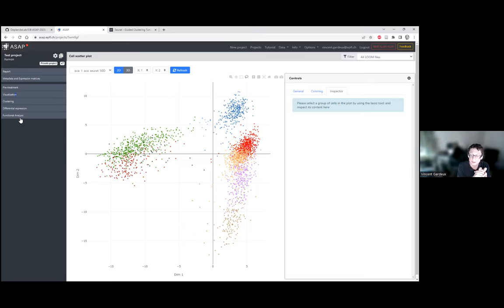So for now we have a pipeline, we have a tool for automatic annotation. We actually use ontology for training a classifier system. So we really use the hierarchical tree of ontology to help the classifier to classify the cells. It's not yet in production. So we are still working on it. But that's something that should come out in the near future.